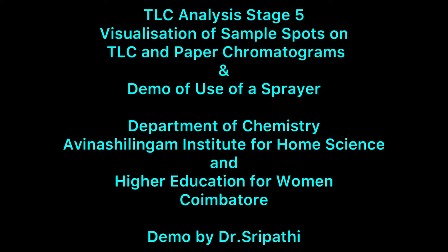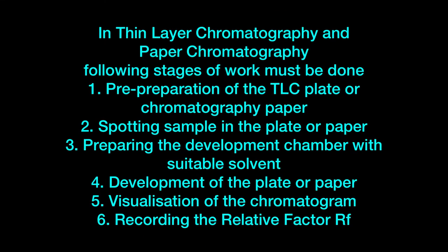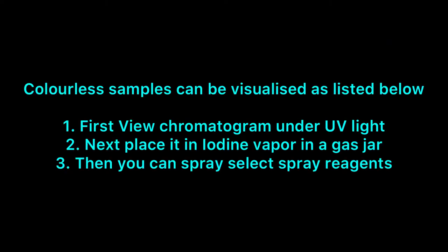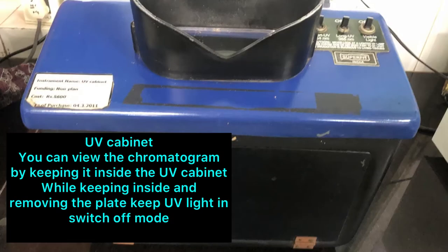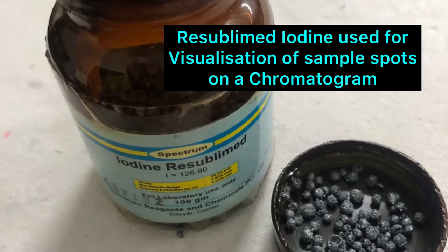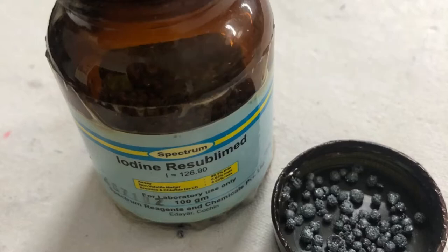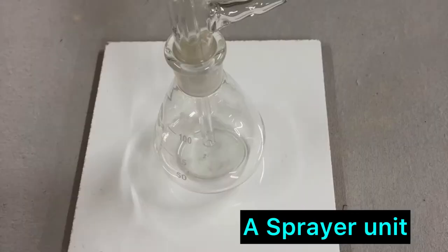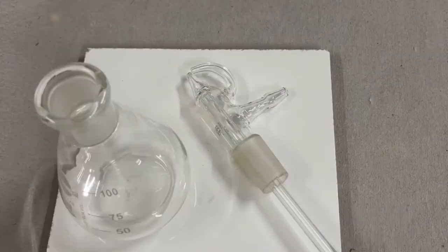Today we will see the use of a sprayer used to spray reagents on the developed TLC plate or the paper chromatogram. TLC analysis involves stages where you will need to visualize the plate, observe the plate in a UV cabinet, then keep it inside an iodine chamber to see for the development of any spots. If there are no spots seen, then you have to spray with the selected spray reagents.